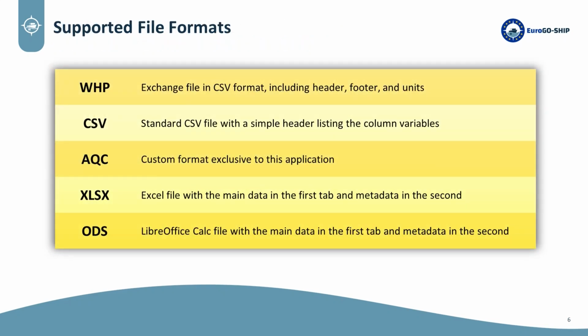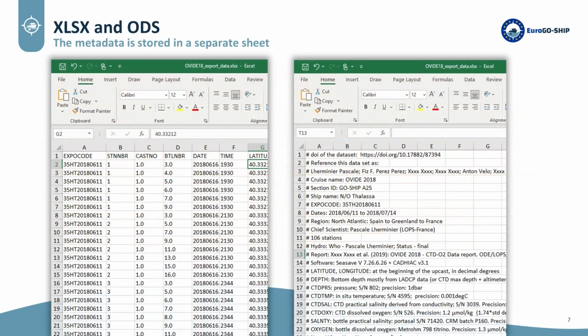The application supports multiple data formats, including WHP exchange files with headers and units, standard CSV files, and a custom AQC format used exclusively by the tool. It also handles spreadsheets: Excel and ODS files organize main data and metadata across separate tabs.